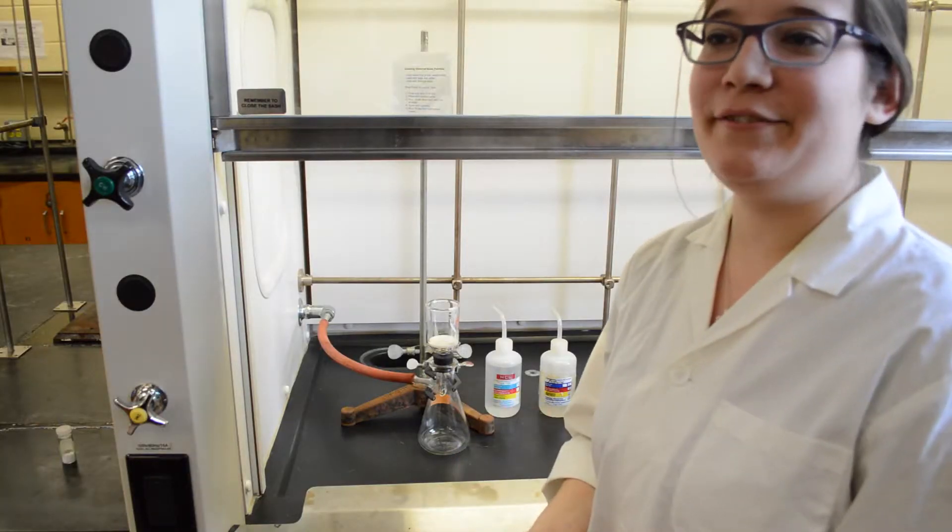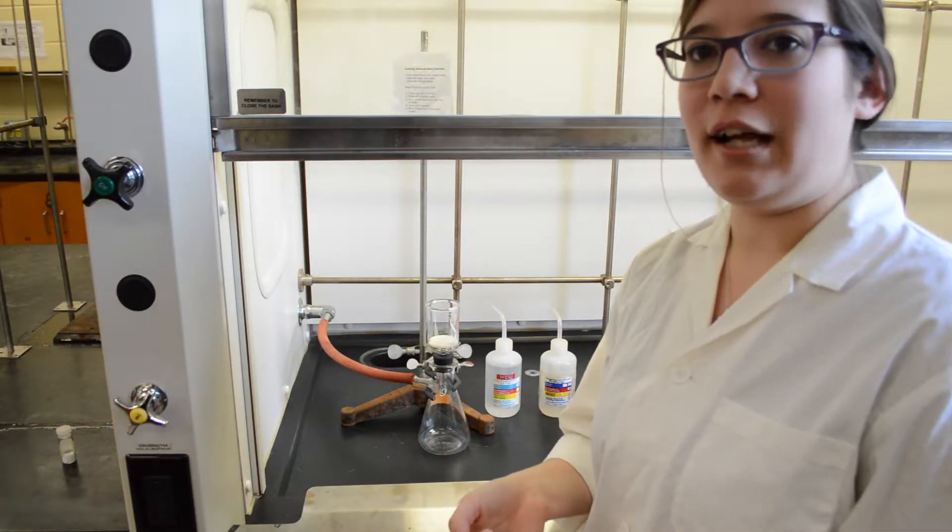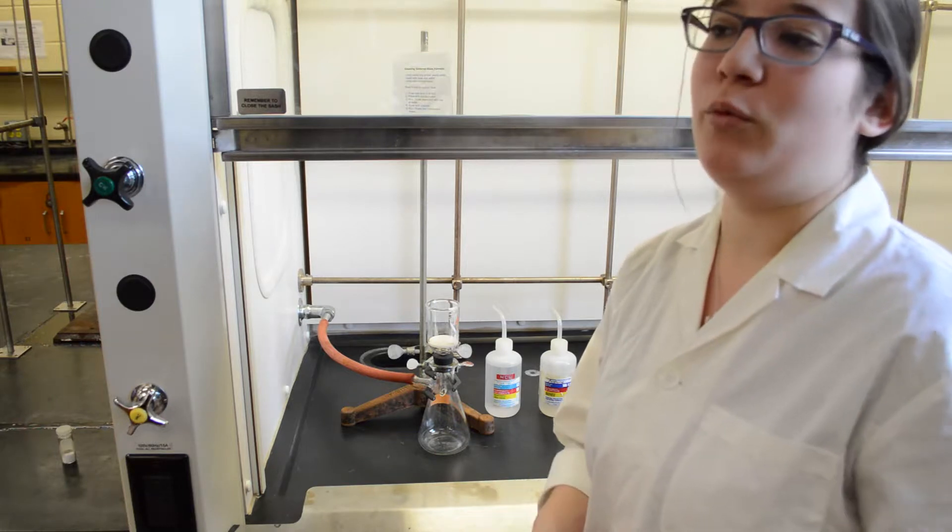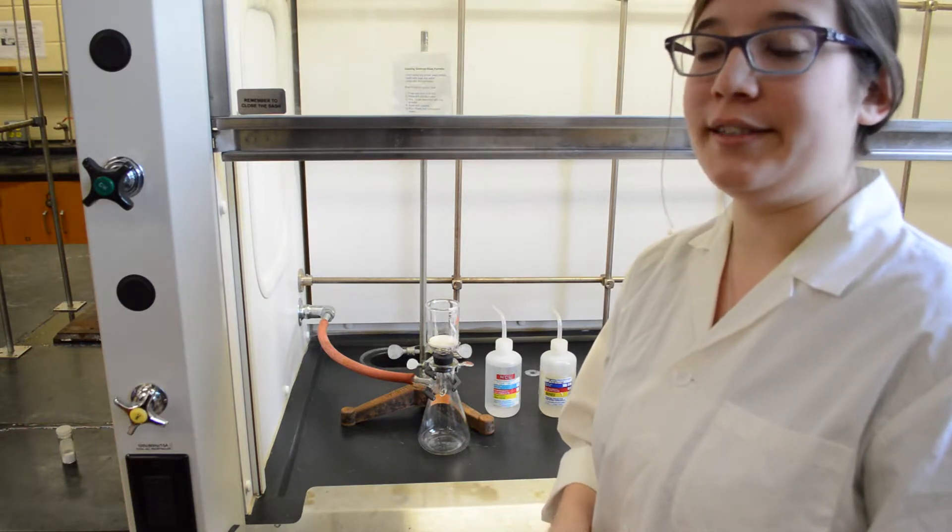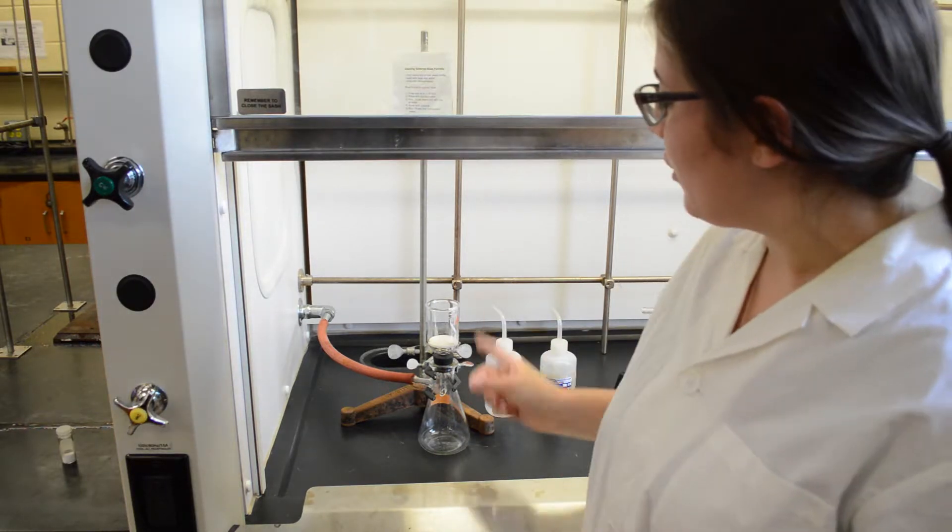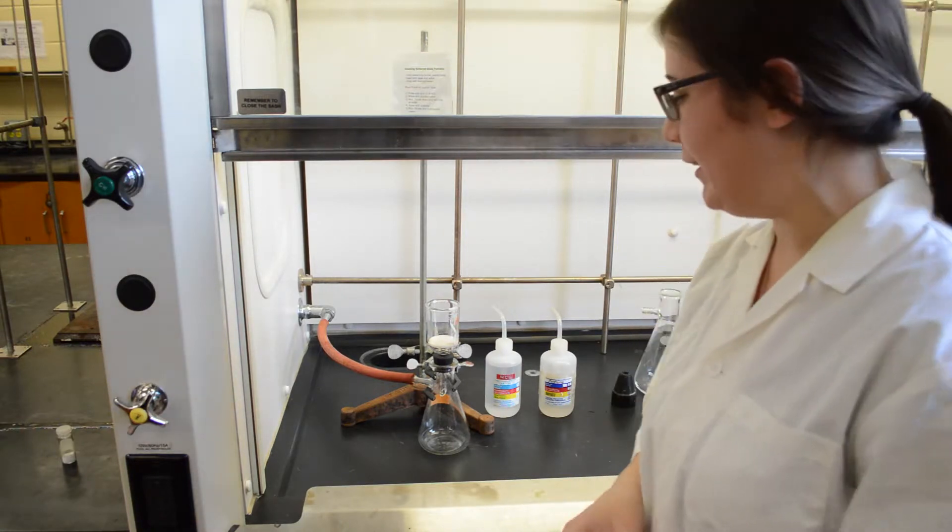Once you're done using your sintered glass funnel, first rinse the excess solid into the appropriate waste bottle and wash it with warm soapy water in the sink and then some distilled water. Then you can bring it over to the sintered glass funnel cleaning station.